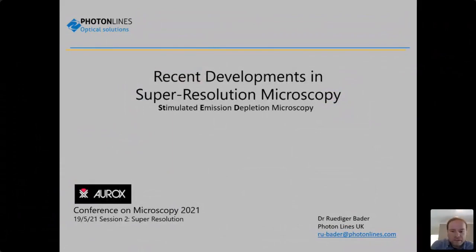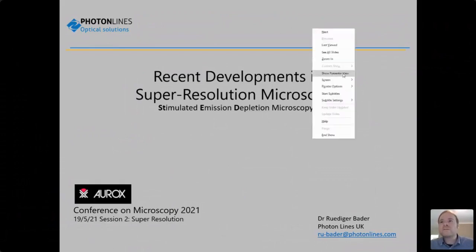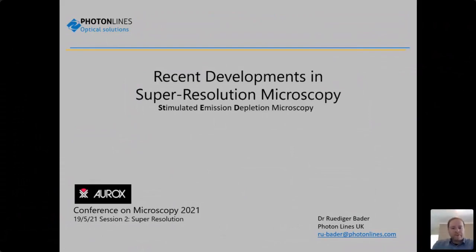Yeah, I will talk about recent developments in super resolution microscopy, in particular STED, some new inventions. So first, I give a speed introduction into STED.